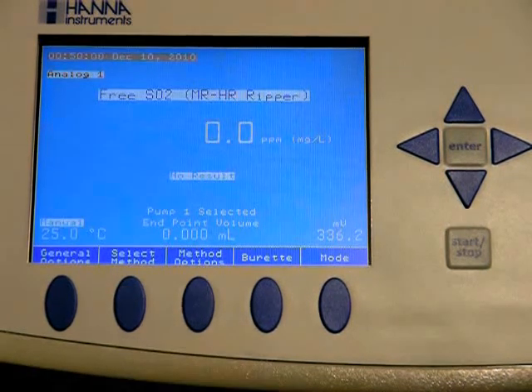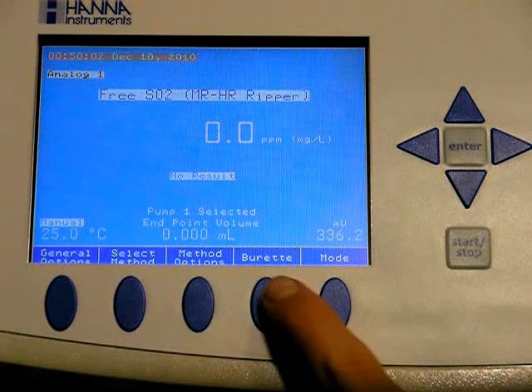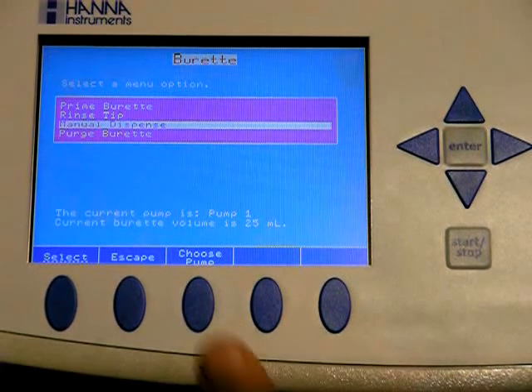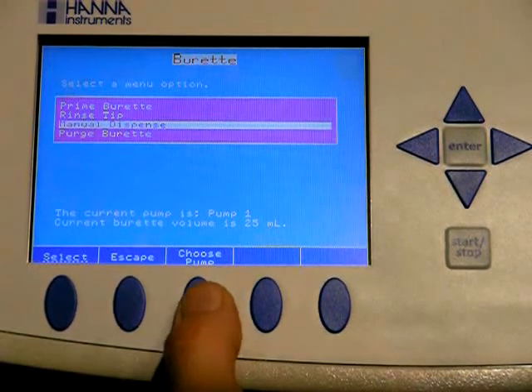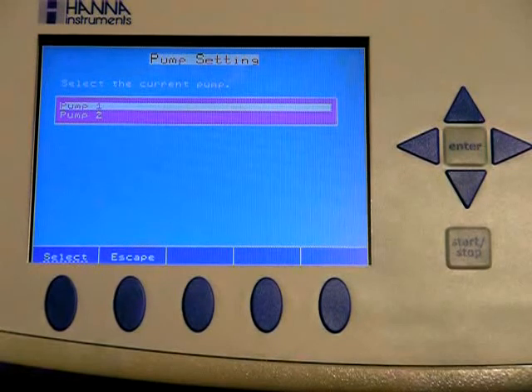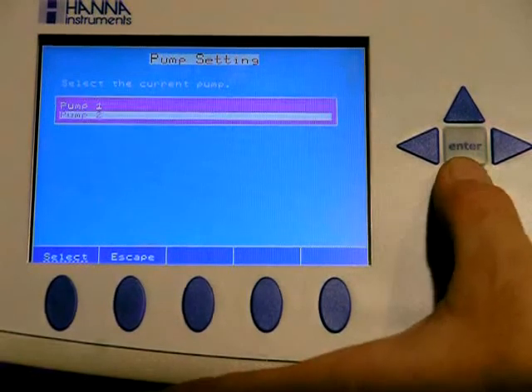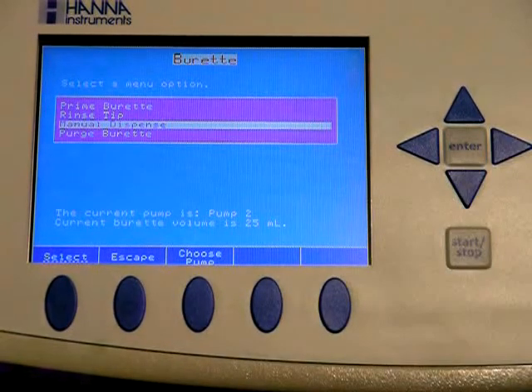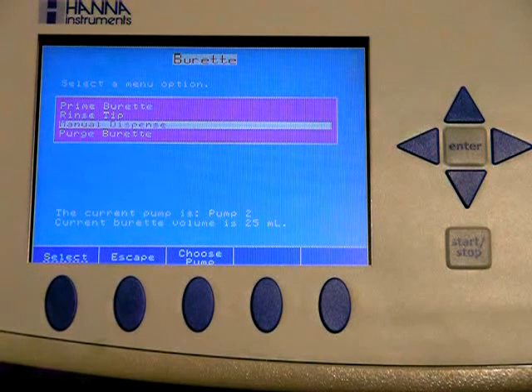If you're running a two pump model, you can also enter the burette to choose which pump you'd like to run the features on.